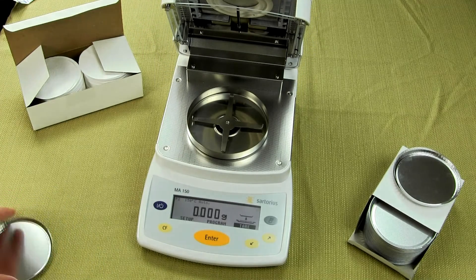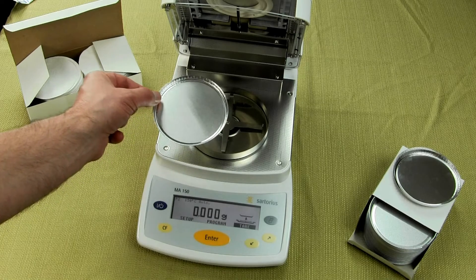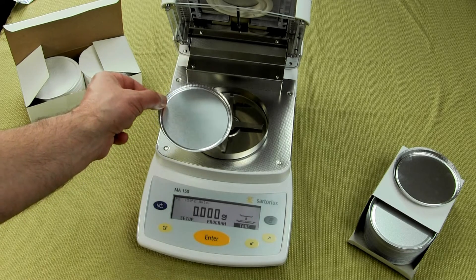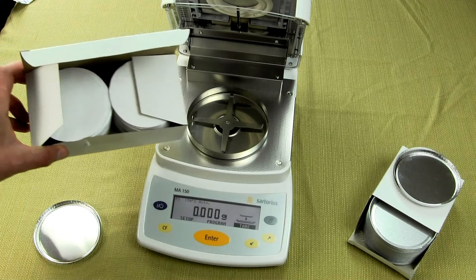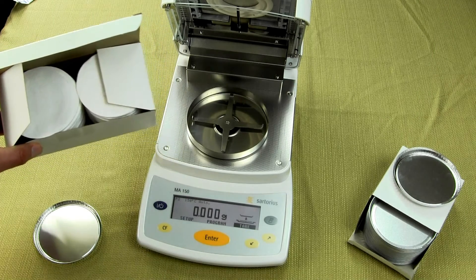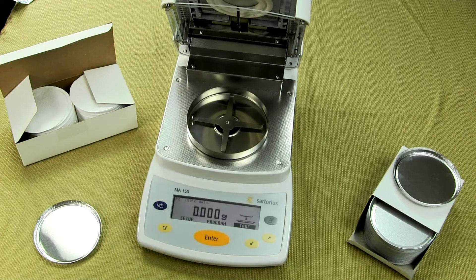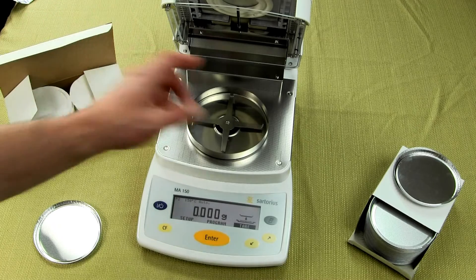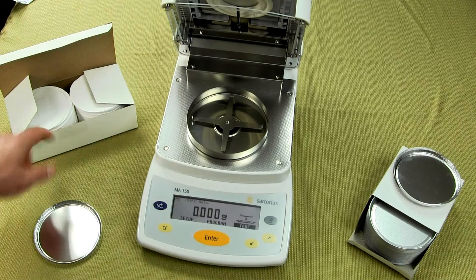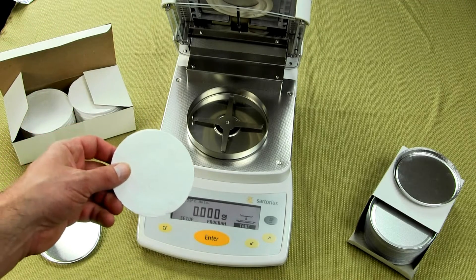This moisture balance uses a standard 90-millimeter disposable pan. When you purchase the MA-150, it comes with 50 disposable pans. You can also purchase optional filter pads. The filter pads would be used for testing if you're doing samples that are going to spatter — anything with high fat content or a lot of moisture. If it's going to spatter, if you look at the top of your moisture balance and there's any foreign material, you really want to consider using the filter pads.